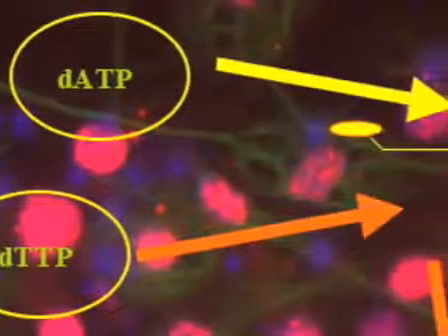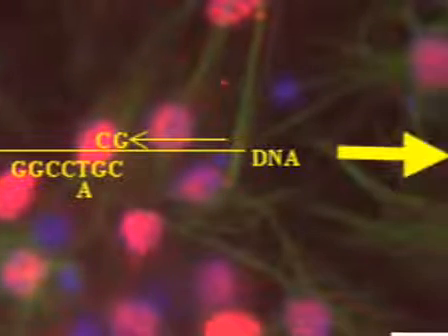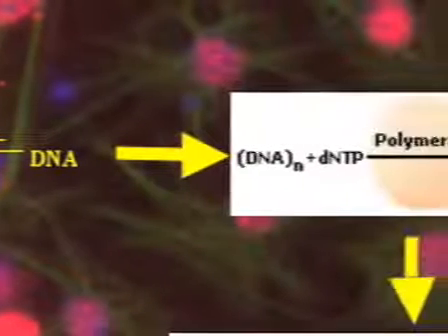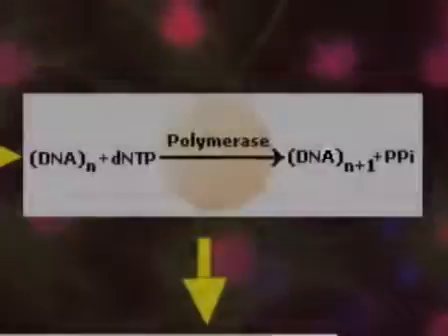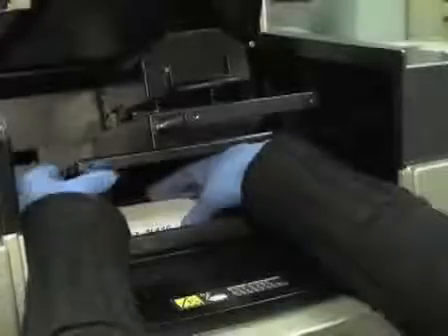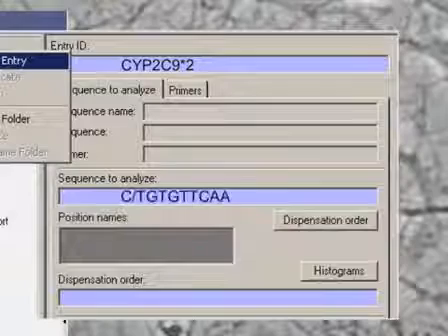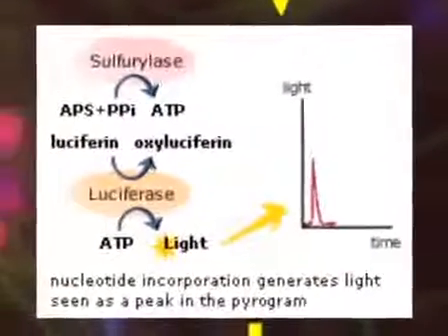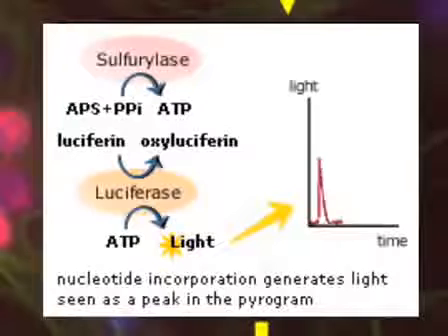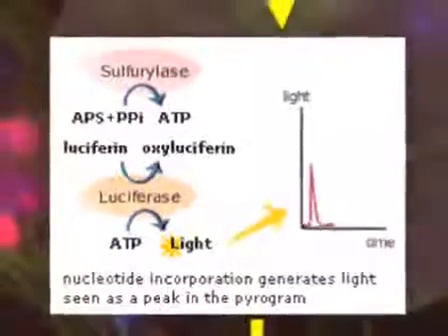Pyrosequencing is based on sequencing by synthesis, taking advantage of the release of pyrophosphate whenever a nucleotide is incorporated in an open 3' DNA strand. Once a plate is loaded, nucleotides are incorporated based upon a sequence provided by the software. Once released, the pyrophosphate is used in a reaction that results in the release of ATP, which is used by luciferase to convert luciferin to oxyluciferin, resulting in the emission of light.